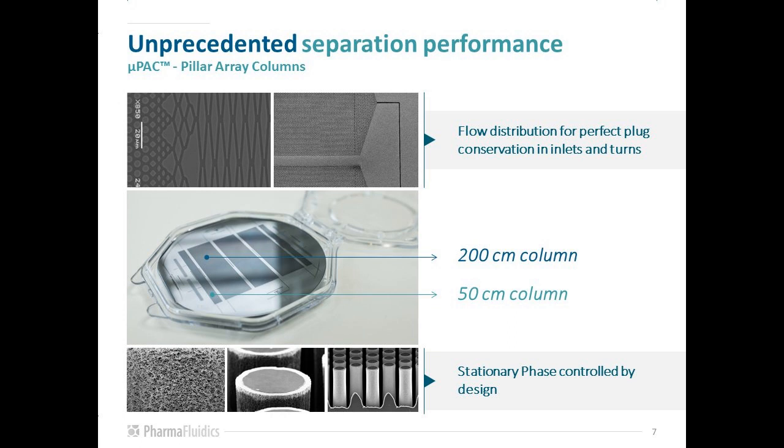Making microfluidic turns without introducing additional dispersion is quite difficult, because racetrack effects, where the inner lane is shorter than the outer one, need to be avoided. To avoid these effects, we use proprietary flow distribution and collection structures at the beginning and the end of each lane.